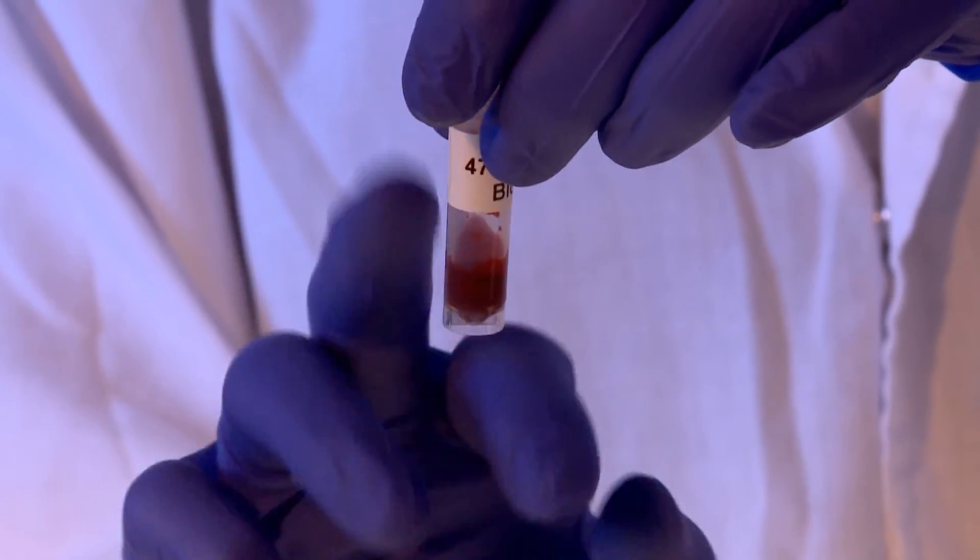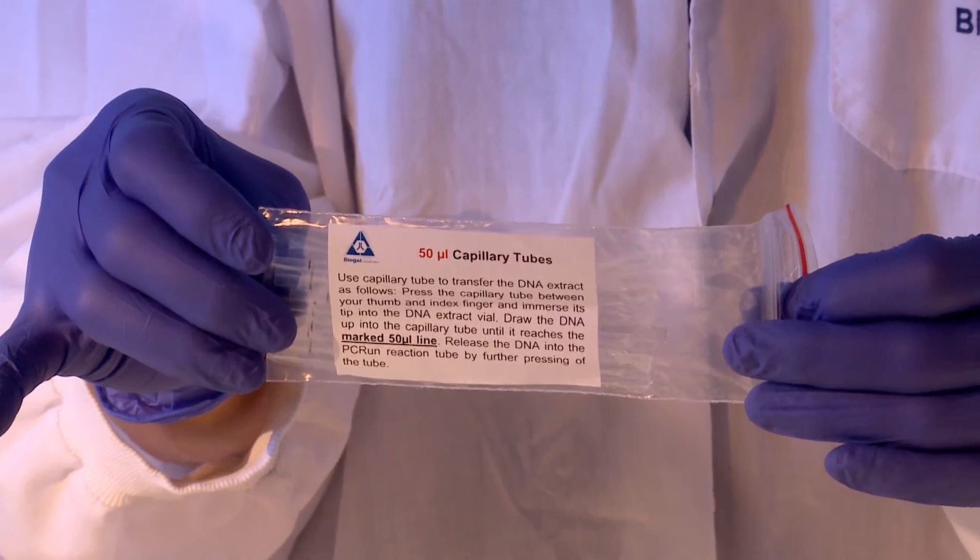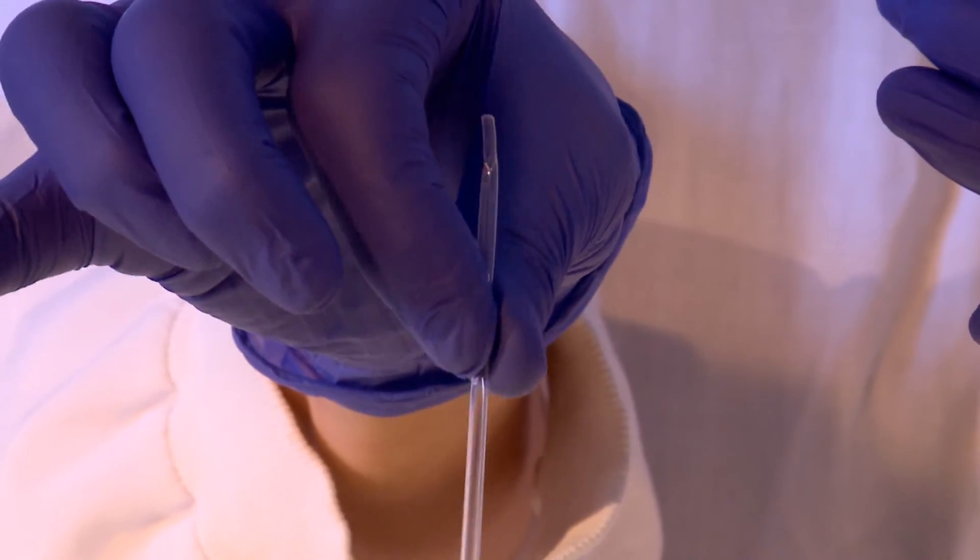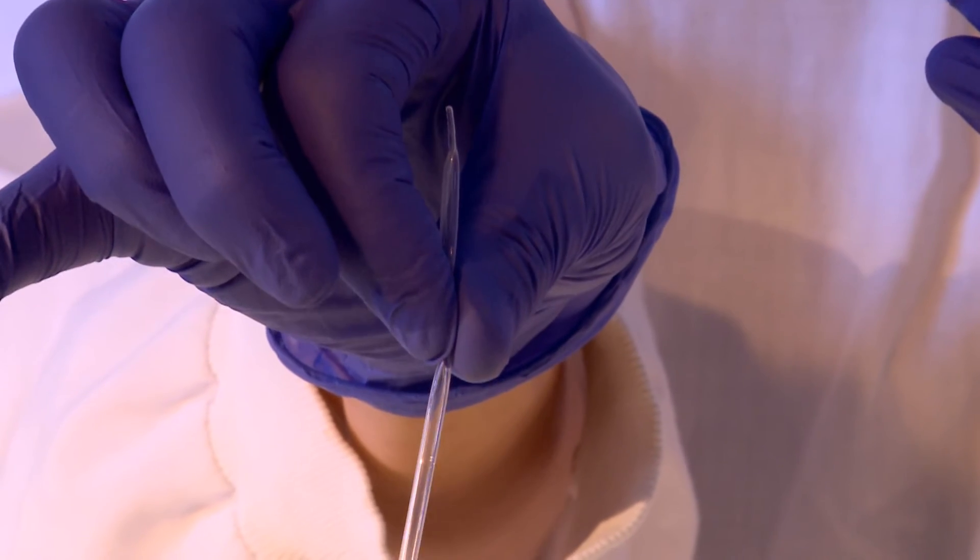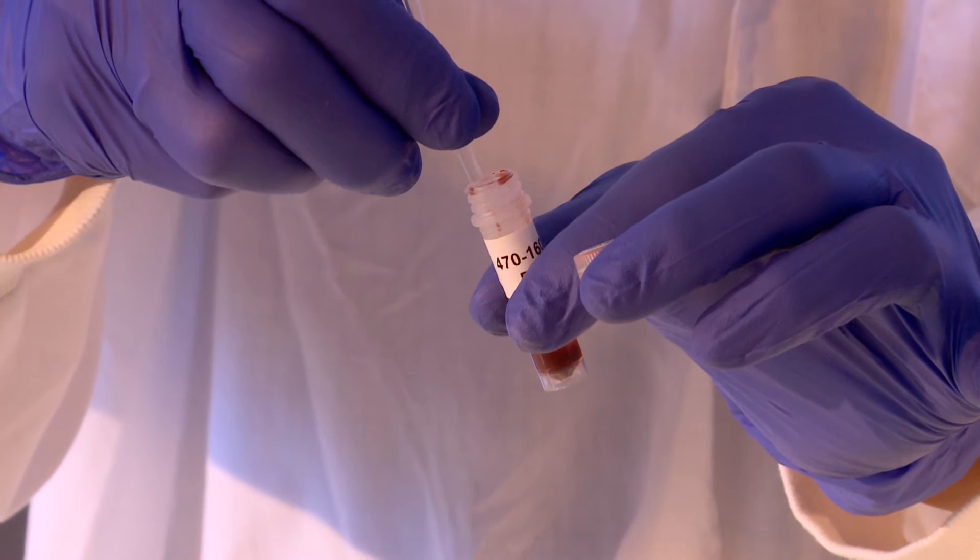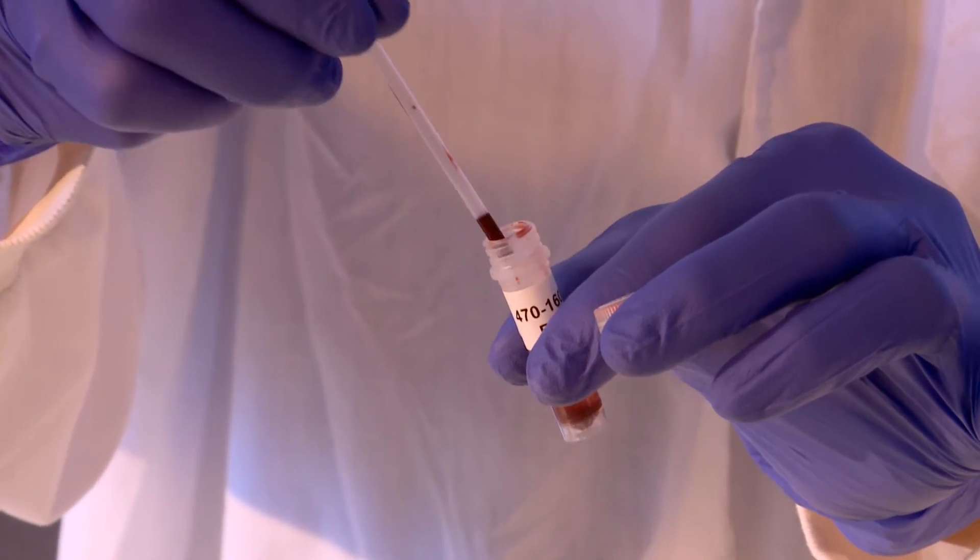Mix the blood sample thoroughly, then using the disposable capillary tubes, remove 50 microliters of blood. This is performed by first depressing the capillary tube while outside of the sample, then placing the tip into the blood sample and releasing the pressure until blood is drawn up to the level of the black line.